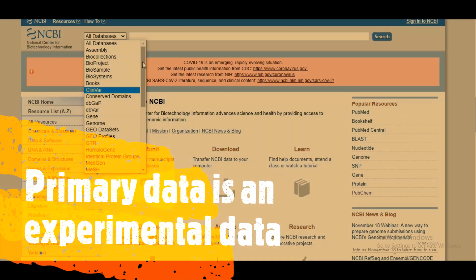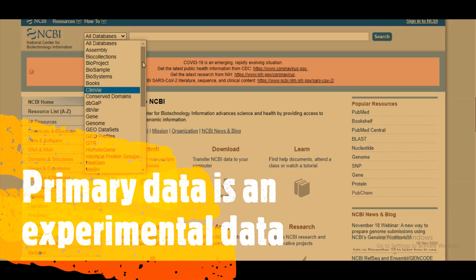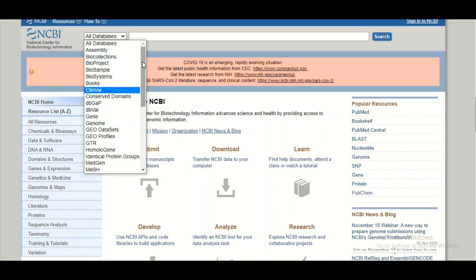Primary databases are those where primary information is stored — information that comes directly from an experiment. For example, if you performed sequencing, you would submit that sequencing data into a primary database. The Nucleotide database is an example of a primary database.